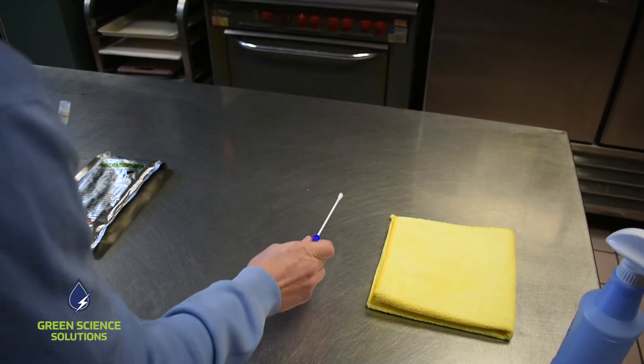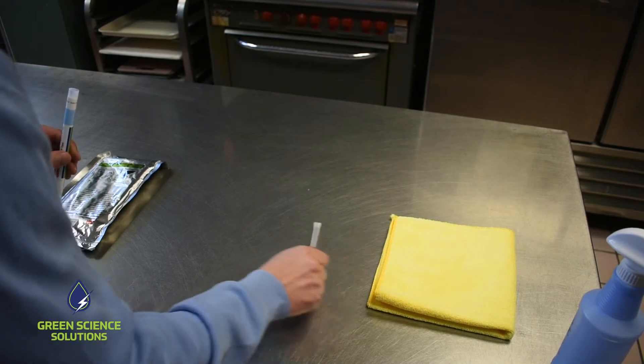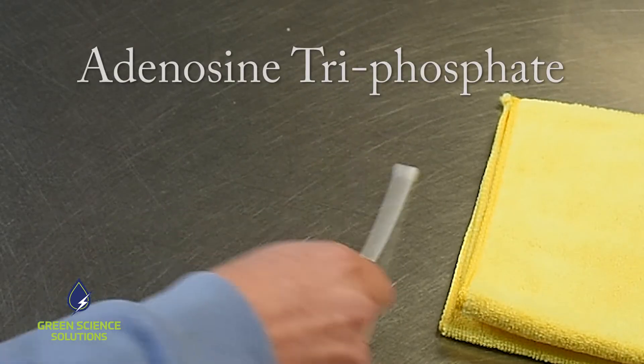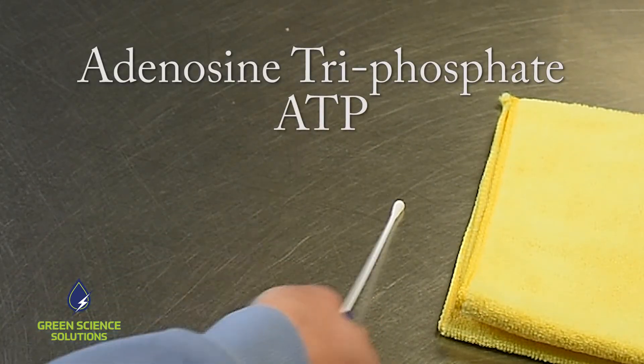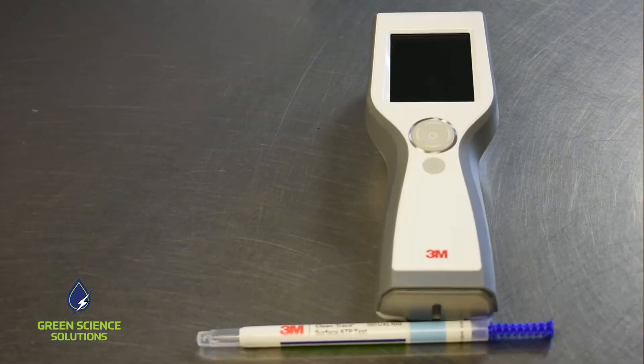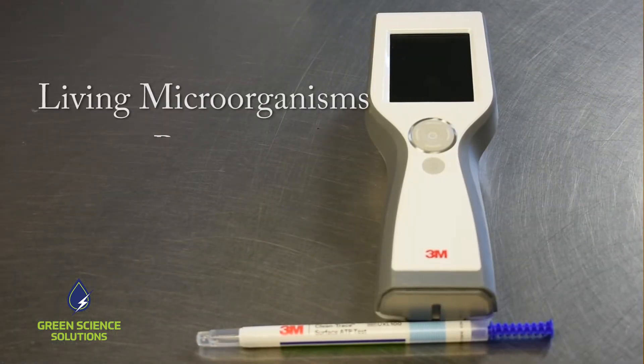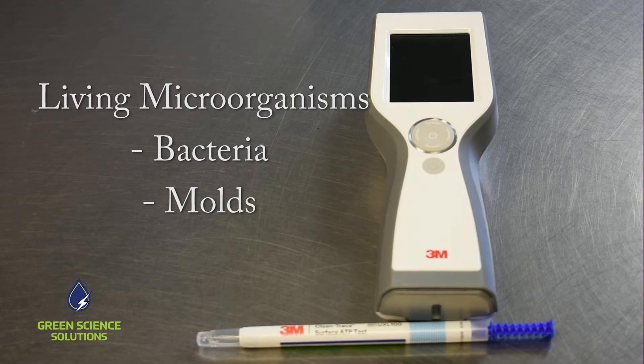You simply swab the surface area you intend to clean. By doing so, you are now picking up adenosine triphosphate, also known as ATP. This is given off by living microorganisms such as bacteria, molds, or fungi.